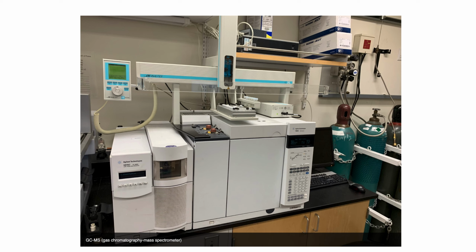Organic chemists often use a solvent to dissolve the sample in. Then it's injected into the machine, where it immediately volatilizes into gas state.